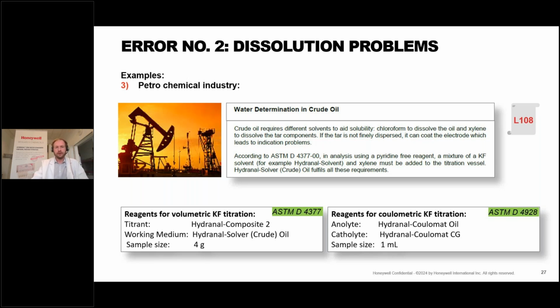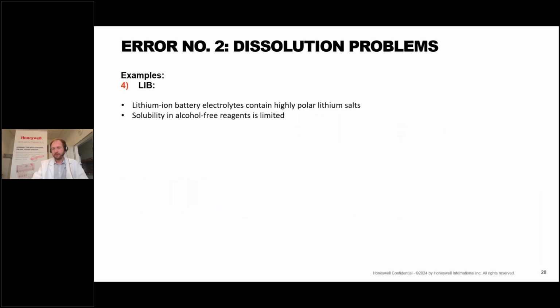4928. Yeah, and for the lithium battery industry, solubility issues are also known, especially if lithium-ion electrolytes are titrated. So these often contain very high concentrations of polar lithium salts, which can easily precipitate and then cause indication problems.